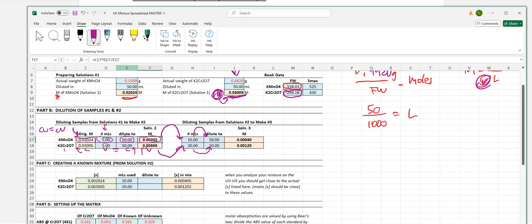You want to carry that digit on through. So that means reference the cells. Okay, so if I click on the 10 here, you're going to see that is a manually entered number. The 50 is a manually entered number. And then the concentration that's getting calculated based on the dilution equation, it's not manually entered. So what I'm doing is that I'm taking, okay, F17, which is the concentration that has been prepared from up above as we've diluted it.